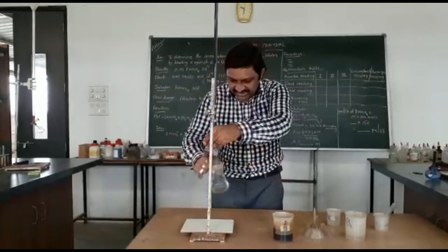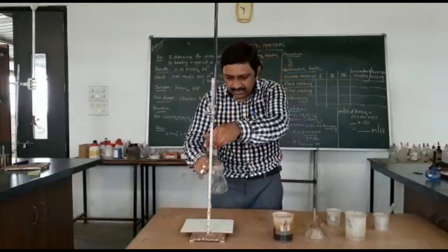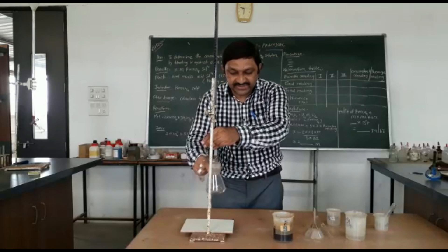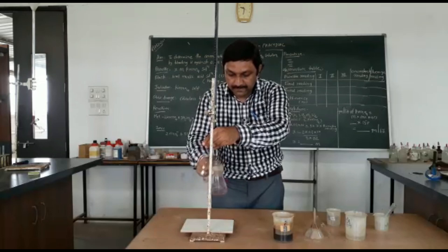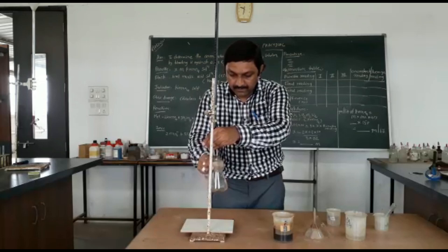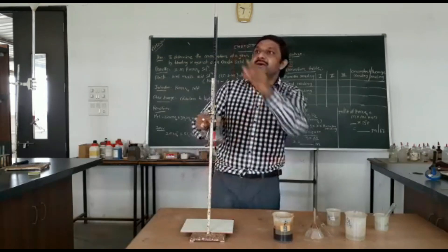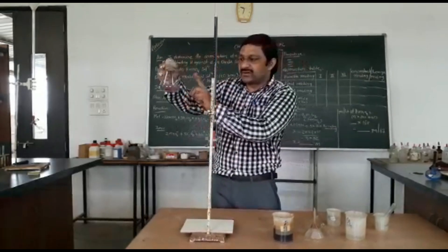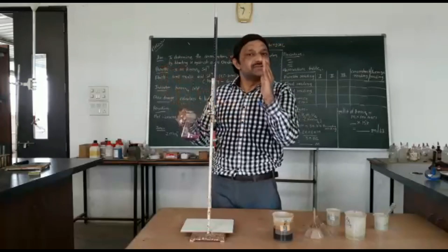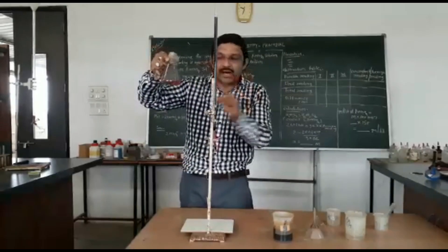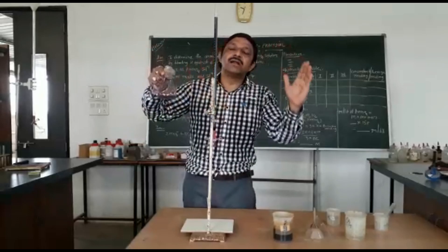Now I am doing the titration. The solution goes from colorless to light pink. Do your titration drop-wise. Here is your permanent pink color — the endpoint has been reached. My reading is 8.78, and your titration is over. Colorless to light pink is the endpoint.